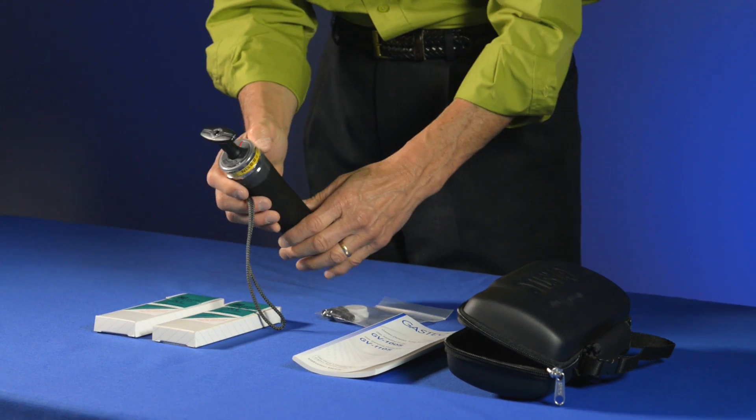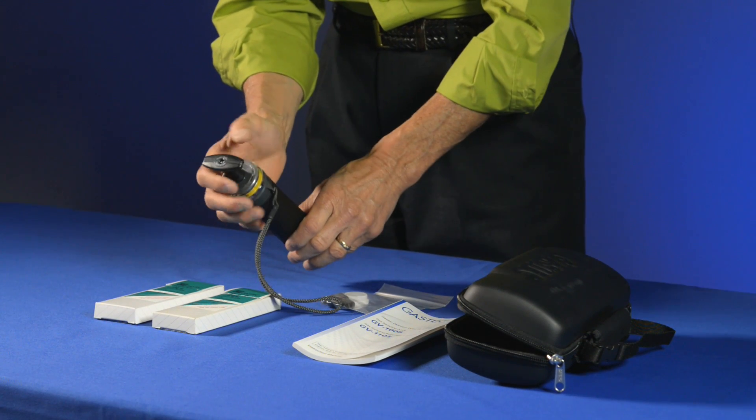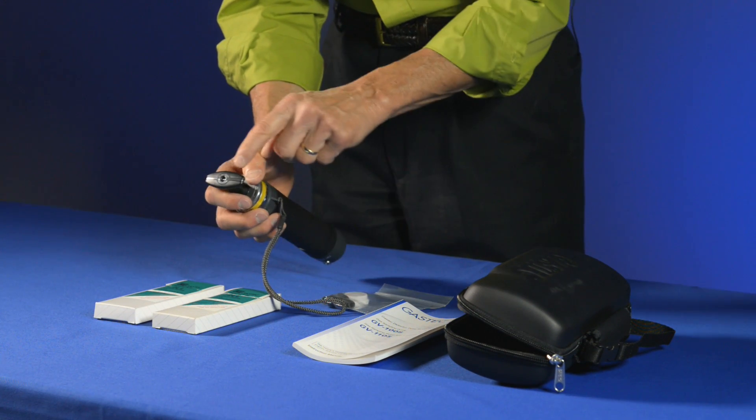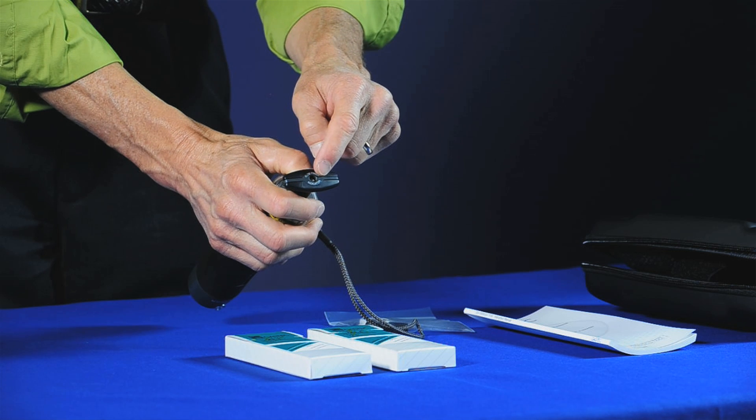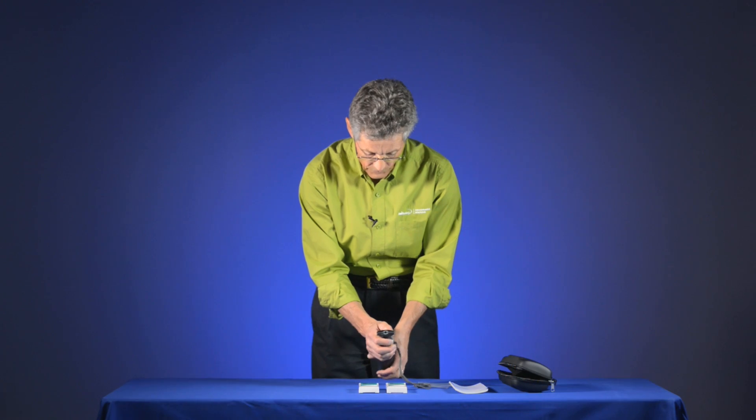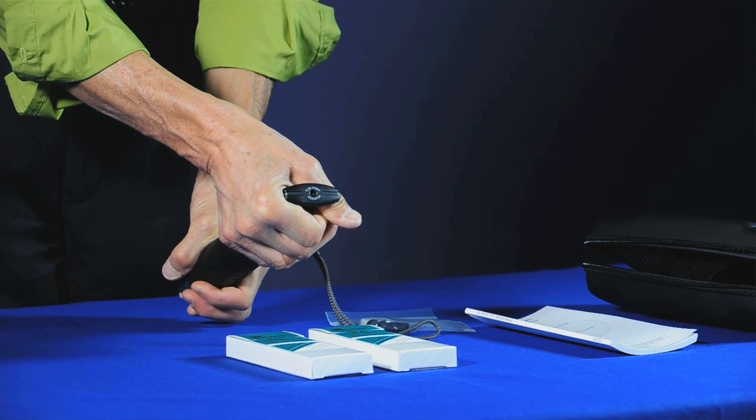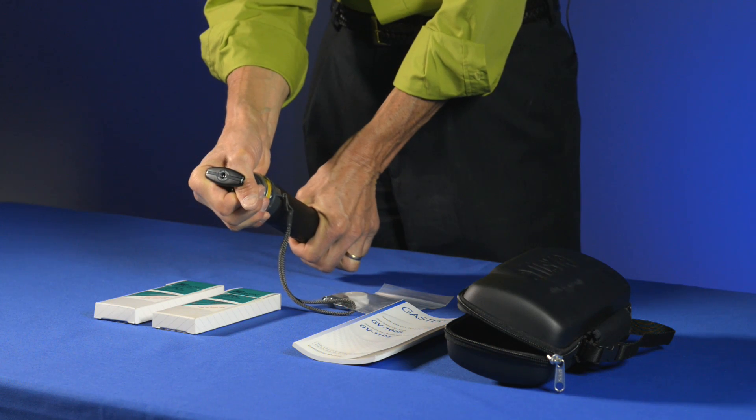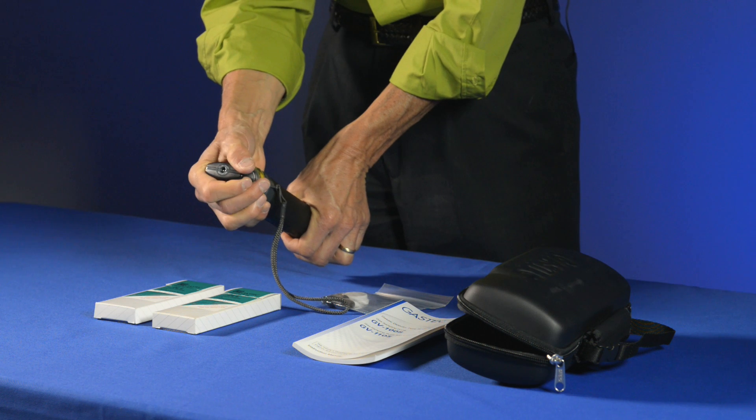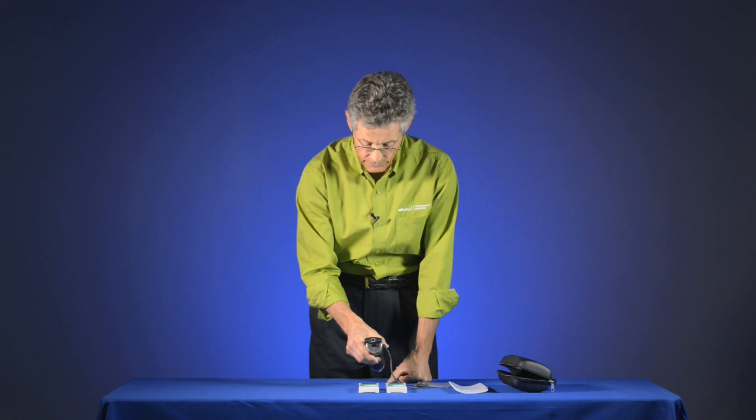And then the other thing that you have on the GasTech Pump is a flow finish indicator. So at the end of the handle you'll see a bright white dot. When I put a tube in and I draw a sample, you'll notice that white dot disappears. And then once the sample is completed, the white dot reappears and the pump is ready to go.